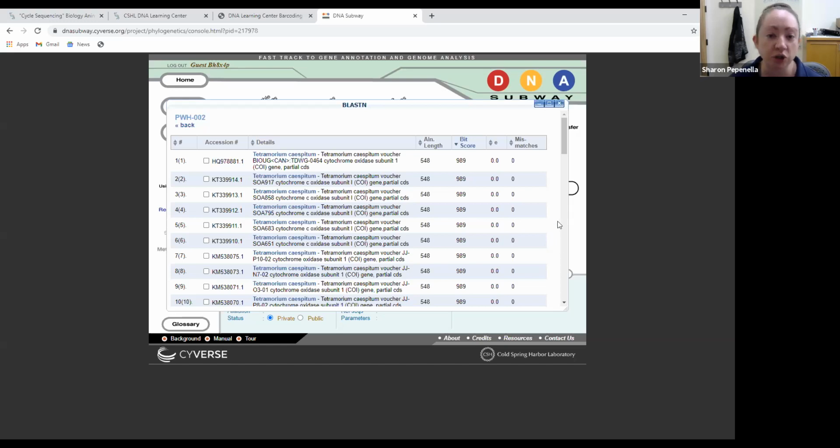So in that case, usually if you see multiple species matches, I would say for the large majority of those samples, they usually have the same genus. So obviously there's just not a lot of differences between the different species within one genus. Can it be different genera? Sure, generally, sure. But usually I'd say that it's just a matter of the same DNA sequence, but different species within one genus. So that's the other thing that you'll tend to see.